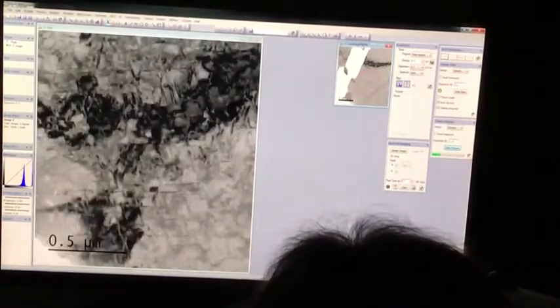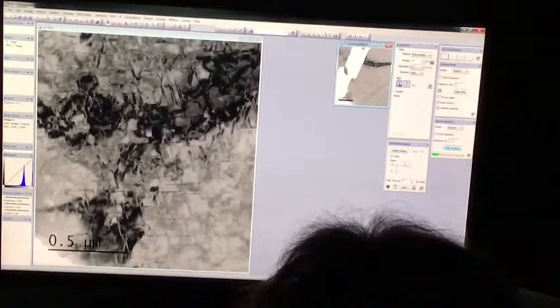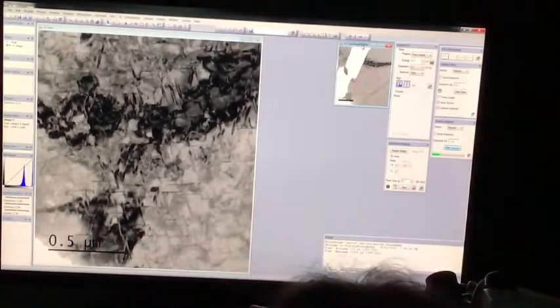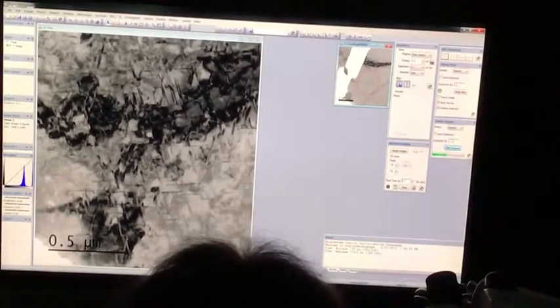Ooh, nasty. And of course I can move that aperture around and that'll change things as well. Oops. I just got a dark field image there that reveals all those precipitates. Okay. So now that we've got this, we're not going to get a hell of a lot better. So I'm going to capture this image, right?